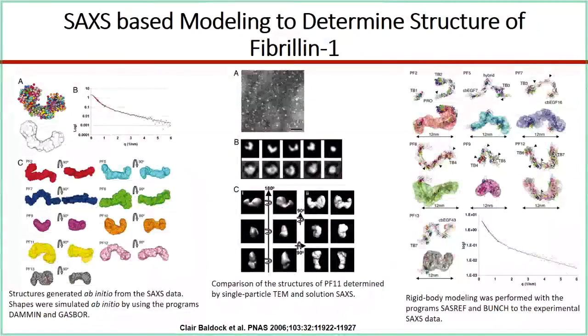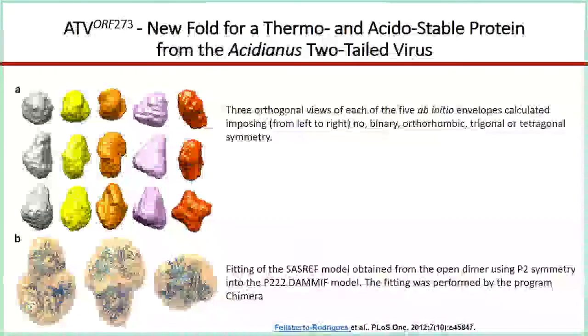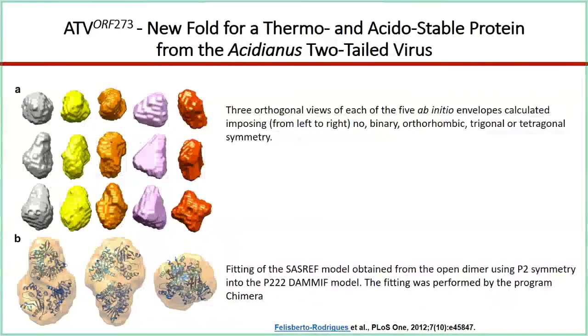So the likelihood of symmetry was high based on their crystallography and the fact that it was a homotetramer. So even if it was a dimer of dimers, the likelihood of symmetry is high. And they did not narrow their choice of symmetry. They just tried everything, and based on which fit best, they decided on which one it actually is. Does that make sense? Yeah, in the chat they say makes sense.